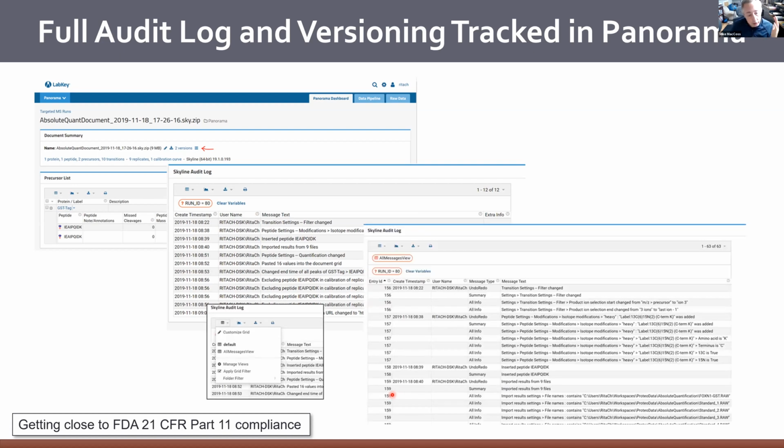And you can, again, with all of these lists that you normally have in LabKey Server, sort them, adjust them, and change the views, but all this data is managed within the relational database.